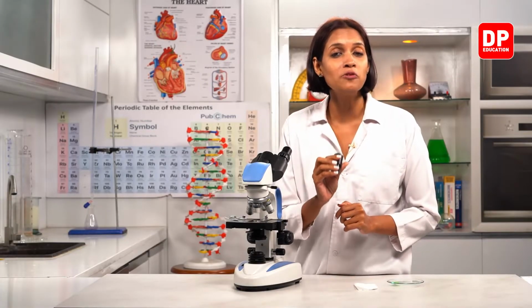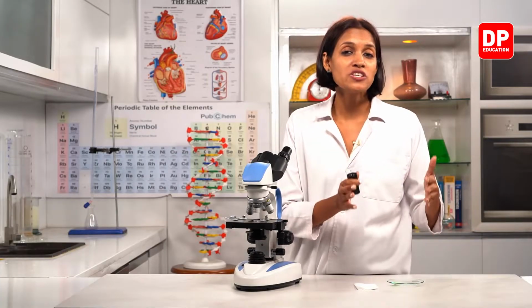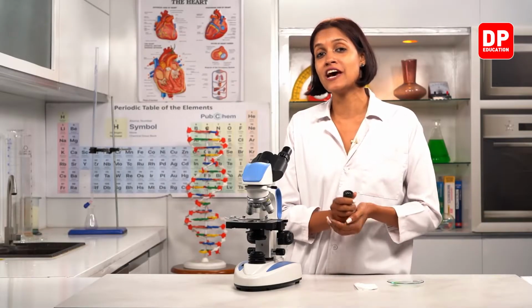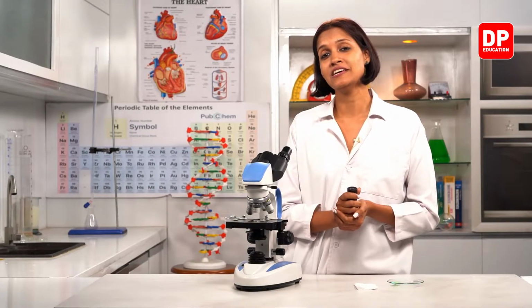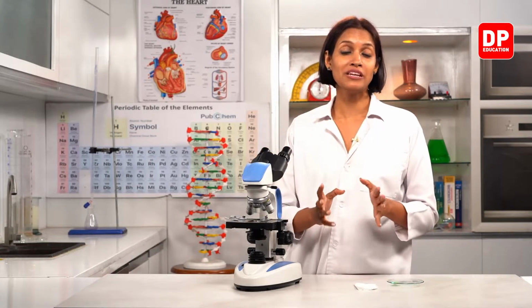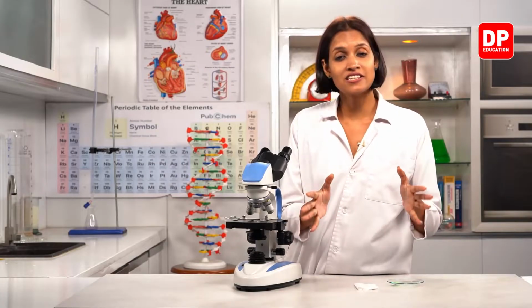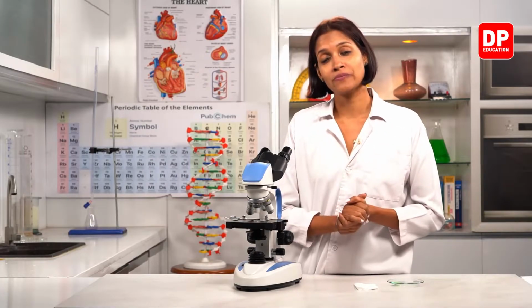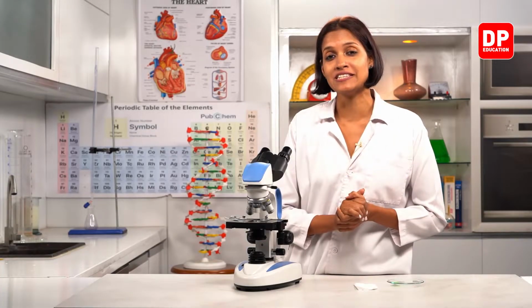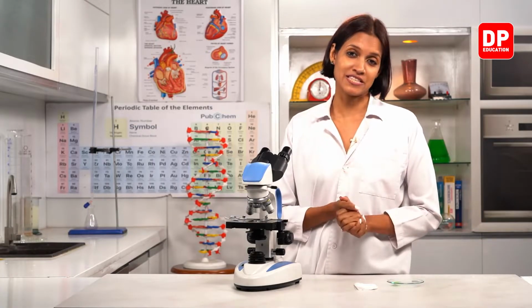We need to remove these lenses and store them in a special type of glass jar. It is an airtight glass jar and it is known as a desiccator. We need to remove all the lenses and store them in a desiccator. We have to make sure inside this glass jar called the desiccator, either silica gel or calcium chloride is present.